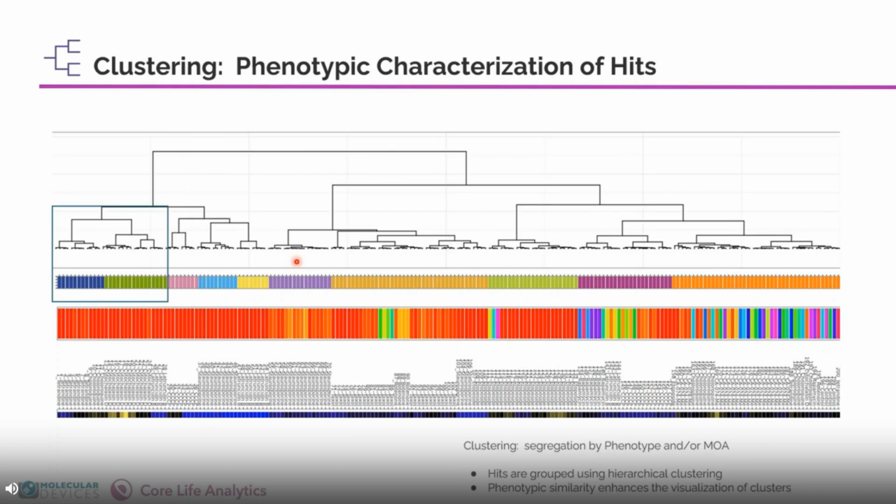Here you can obviously see some of the compounds are clustered together that make total sense. But you also see other compounds being clustered together, for example, chloroquine and tacrolimus, indicating possible similar mechanisms of action to achieve the same phenotypic outcome between the two compounds.